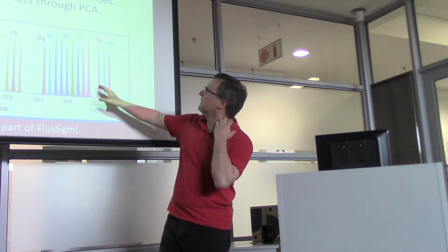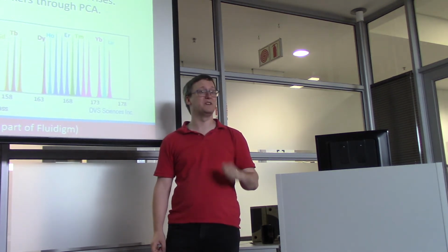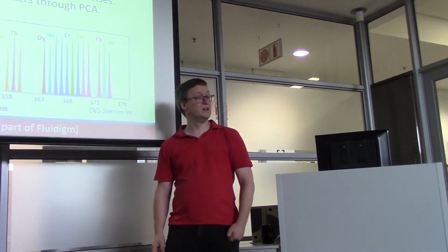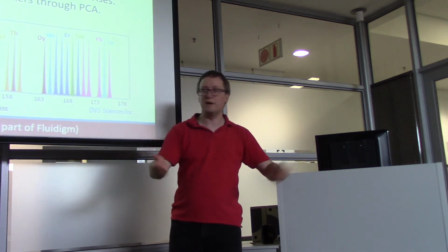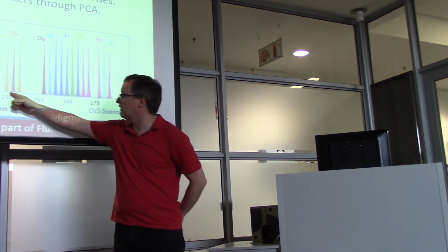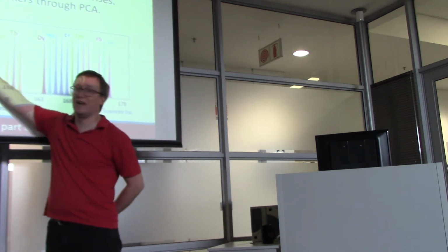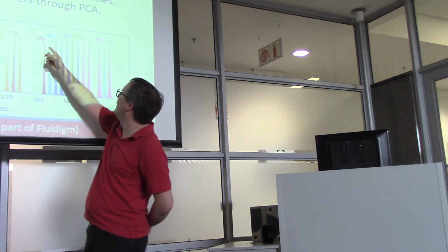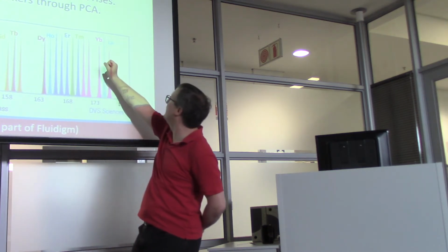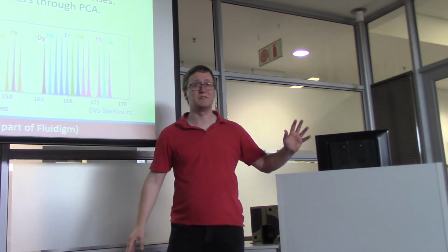So in this case, the Cytof is doing a mass spectrometry measurement of intensity instead of a fluorescence measurement of intensity. So our dyes now are not absorbing laser light and emitting fluorescence. Instead, we are marking our particular markers with different metals. Do folks remember Eu? I think it's europium, isn't it? And we've got, let me see, erbium and ytterbium, goodness me, barium. I've forgotten all the different names.